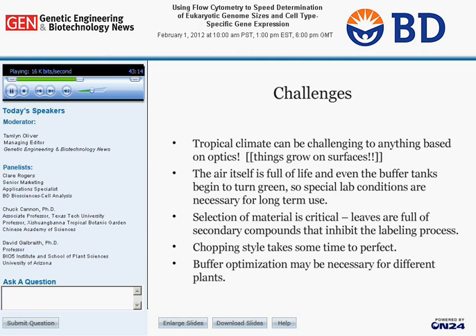She did have to optimize the buffer a little bit as well, and so, you know, different plants have different compounds in them, and so I would expect as you sample more plant species that you'll encounter situations where you're going to have to optimize the buffer in some way. It wasn't a great deal of optimization, but she found that adding a few things to the buffer was very helpful in getting good, consistent results.